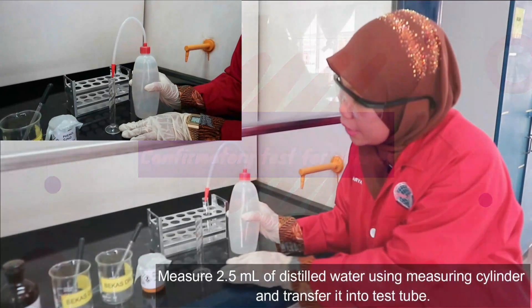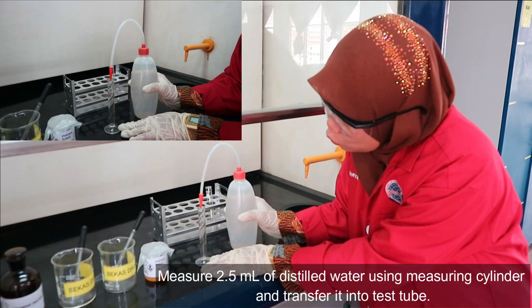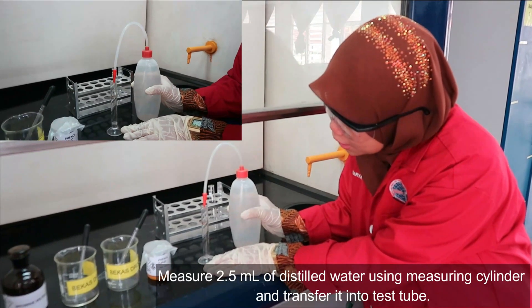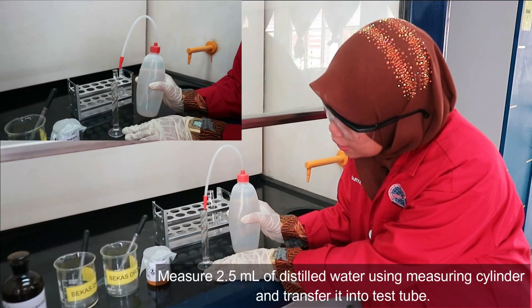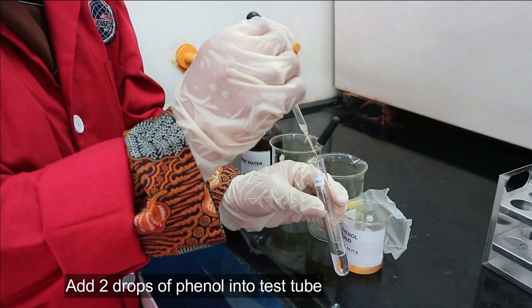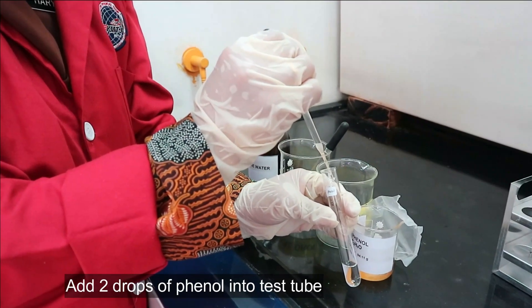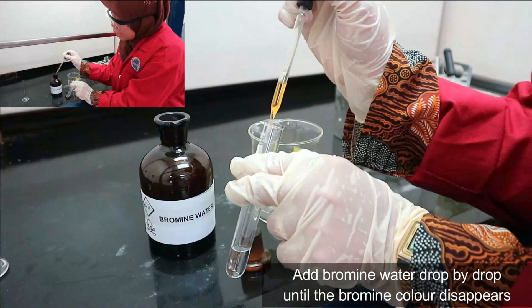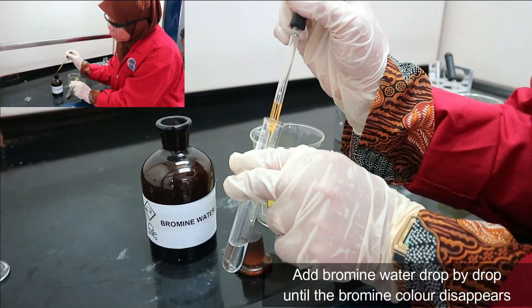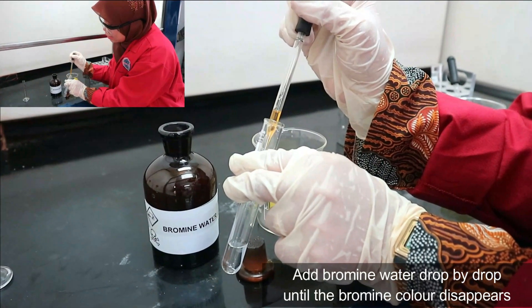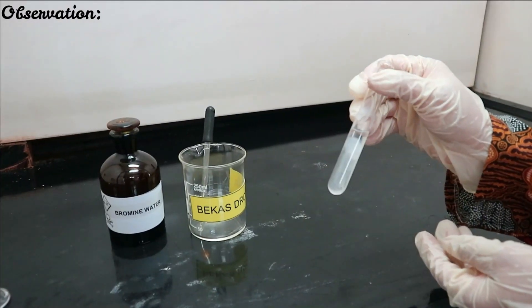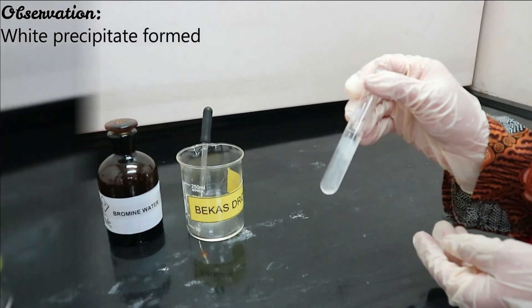Add 2 ml of distilled water into the measuring cylinder and transfer it into the test tube. Add bromine water drop by drop until the color of bromine disappears. You will get a white precipitate as the observation.